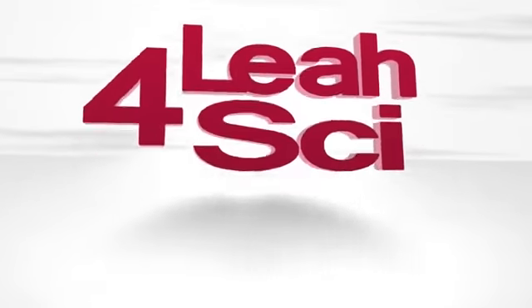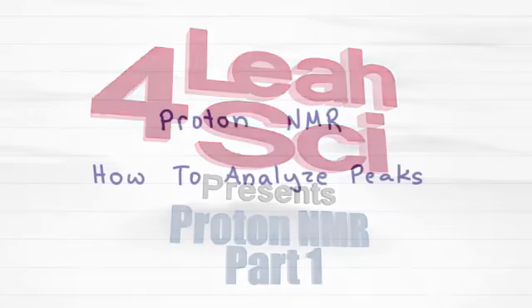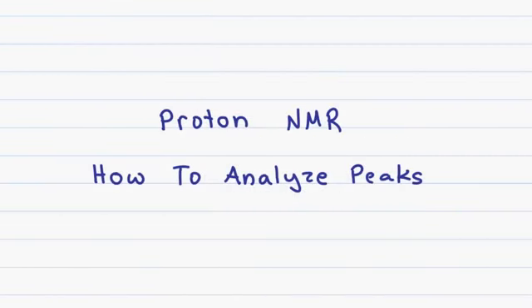Leah here from LeahForSci.com, and in this video, I will show you how to analyze the graph for Proton NMR. There are 4 things you want to look at when analyzing the NMR graph. First, we'll look at how to analyze it, and then we'll apply it to a simple example.